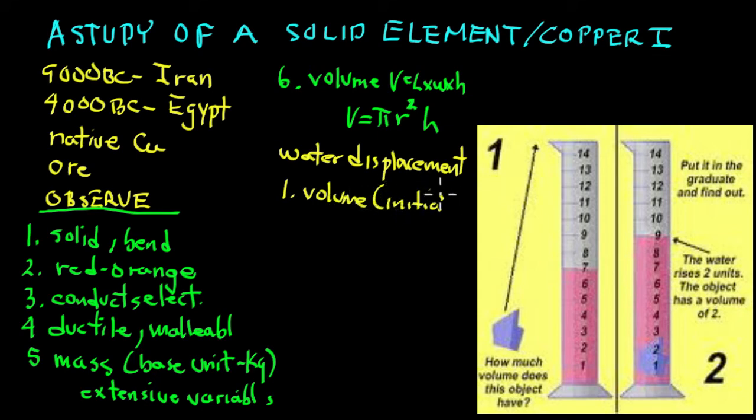Remember, when we read a graduated cylinder, if you haven't had this already, the graduated cylinder will have, it will draw the water here. This is in the graduated cylinder. And when you look at it, you look at this point right there.